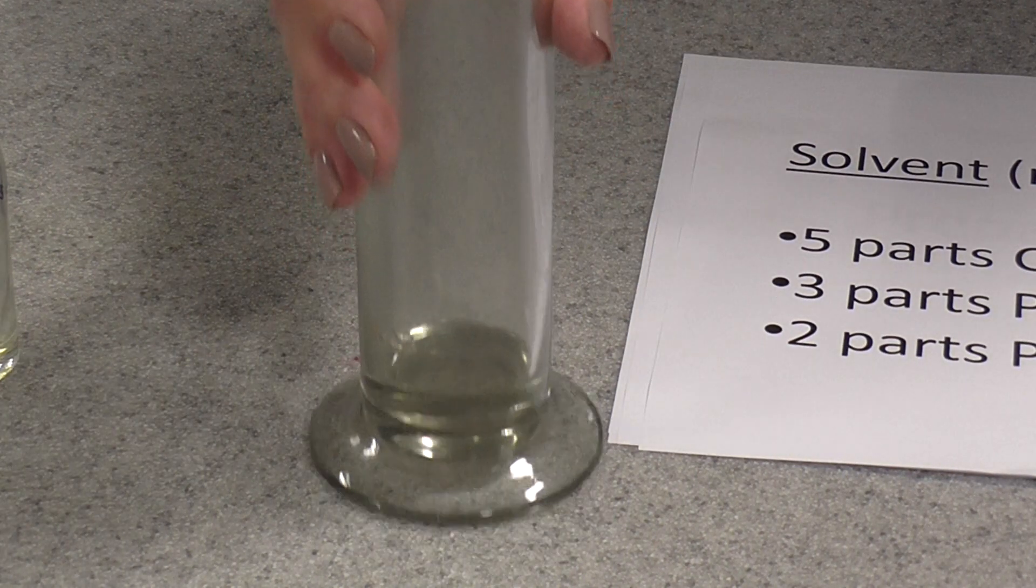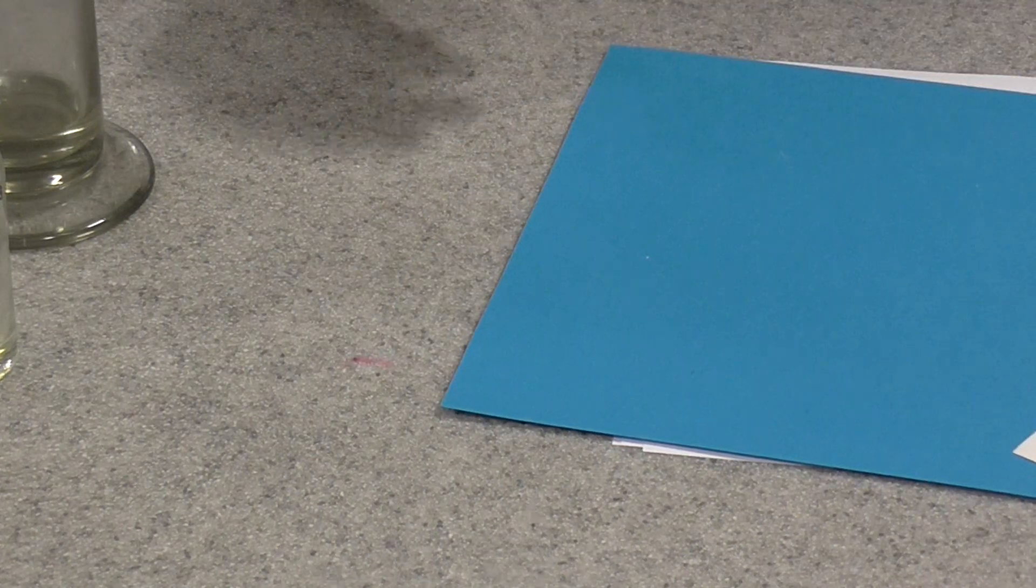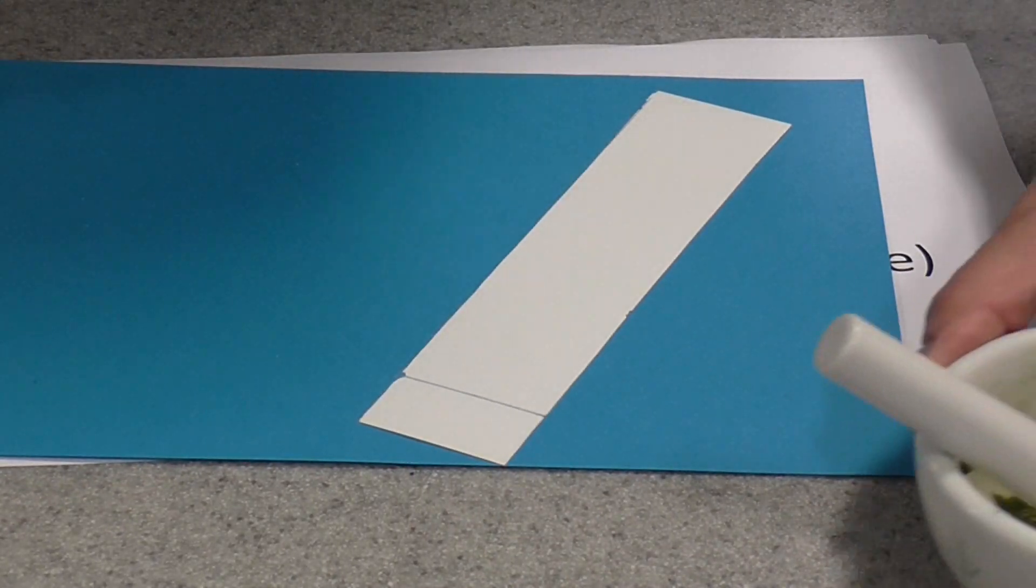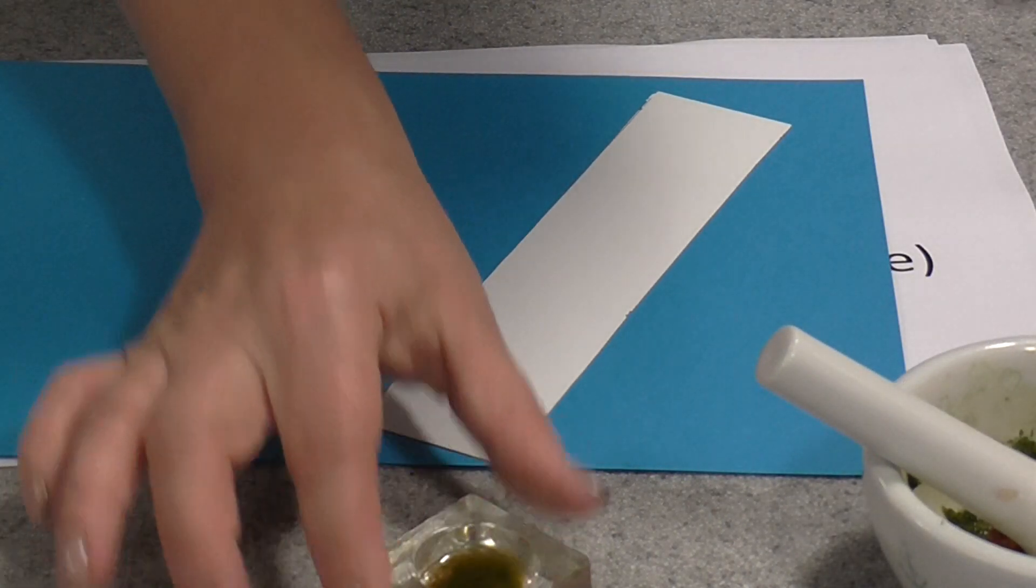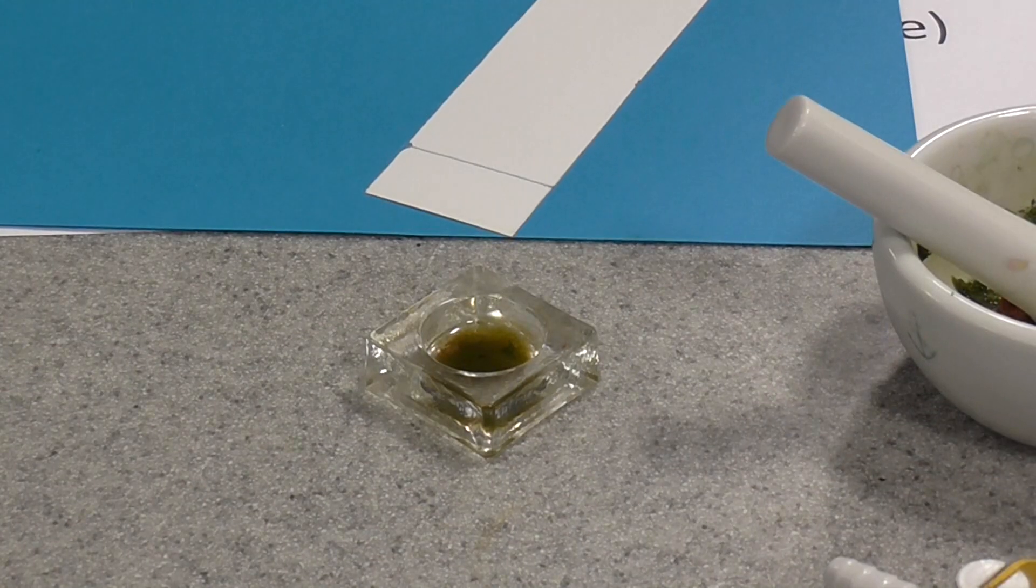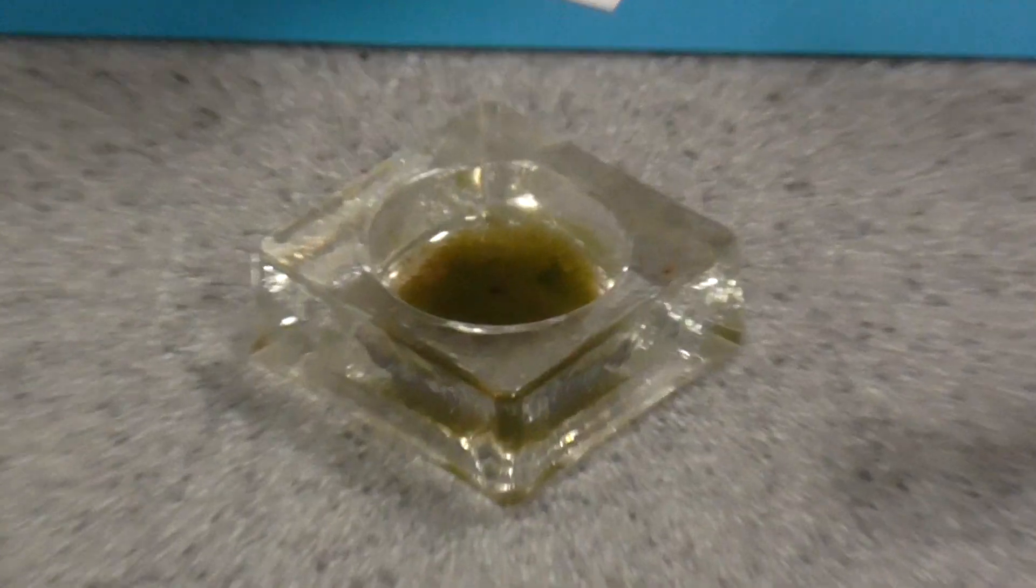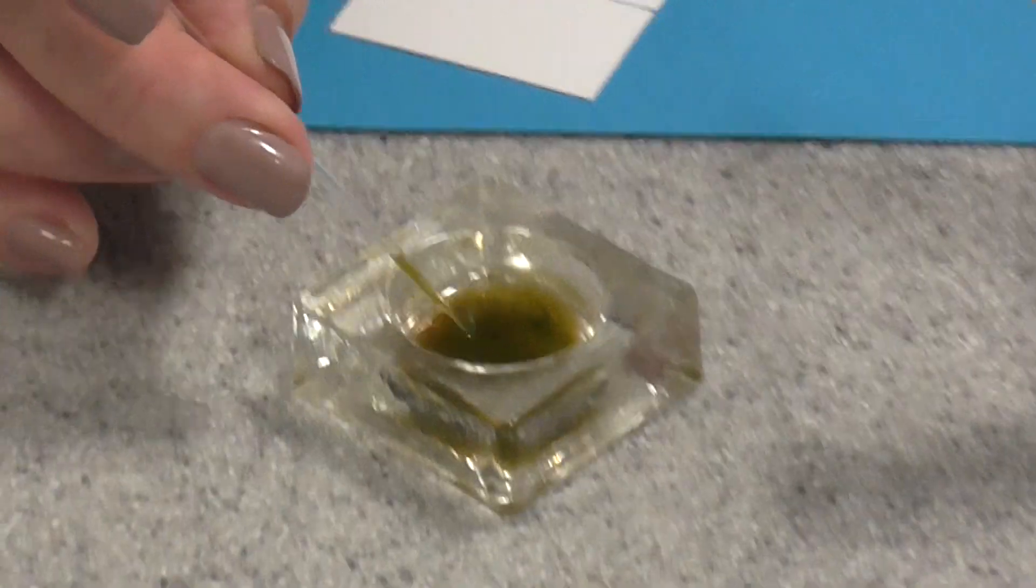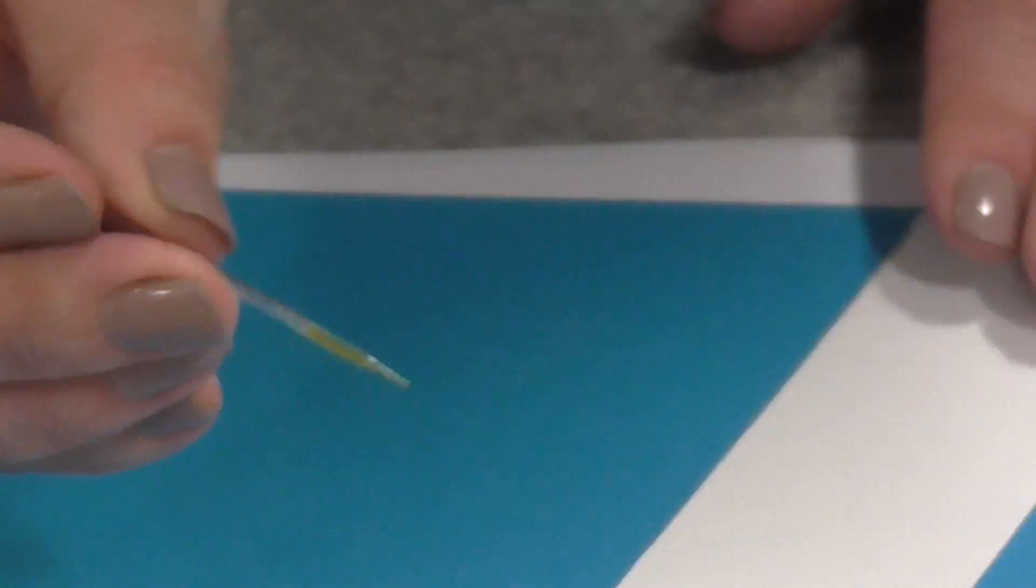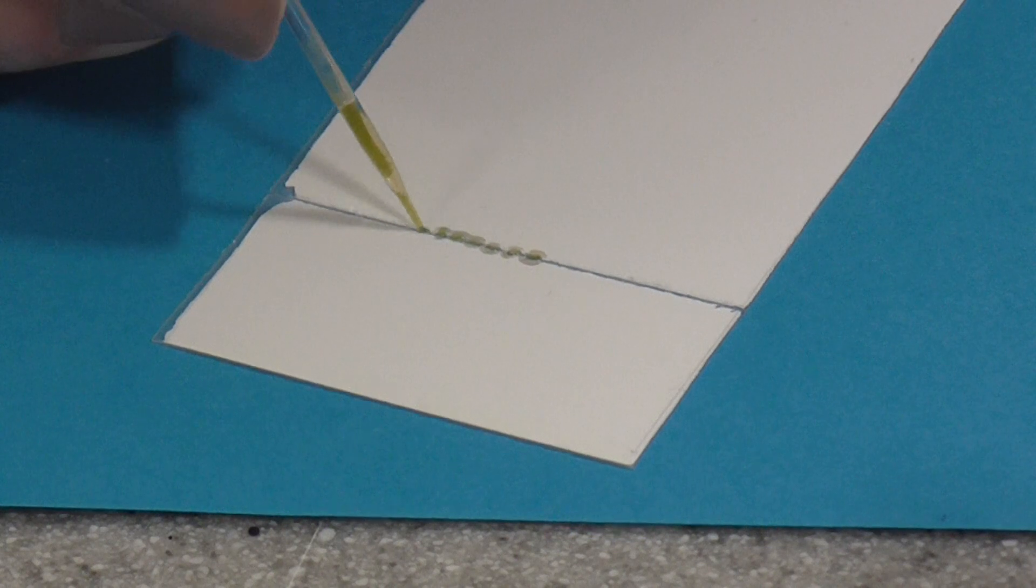Now to go back to the chromatogram, the next thing we need to do is load this with some of our plant pigment. I've got some plant pigment poured into a little watch glass, but you can just do it out of the mortar if you like. What we've got here is a capillary tube that's been heated and pulled out to form a much finer tube. If you dip that into your extract, you'll draw a little bit of the extract into there. Then you need to carefully load it onto the origin line that you've drawn on your paper.